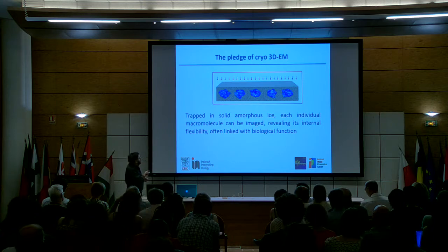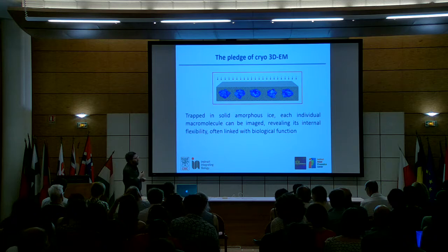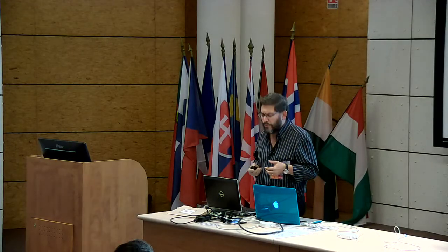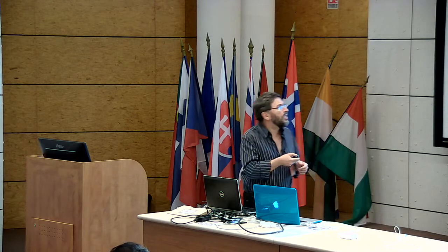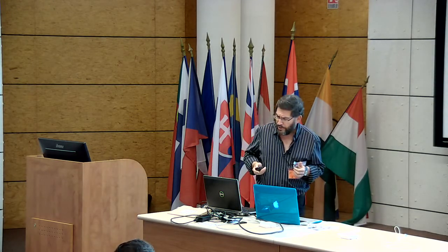My point here that I will be using during the talk is that you see how the different macromolecules are in different orientations, and to come to any 3D reconstruction, to any estimation of the 3D structure, we have to be able to sort them and relate them together, relate the different orientations.